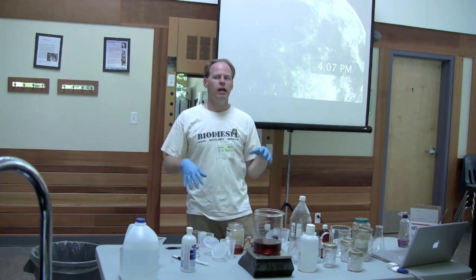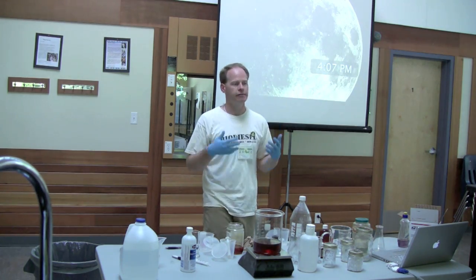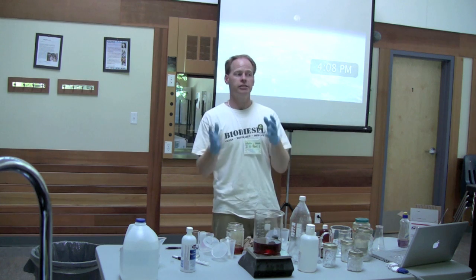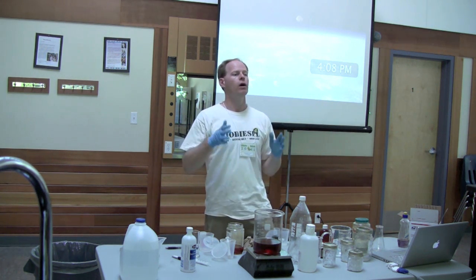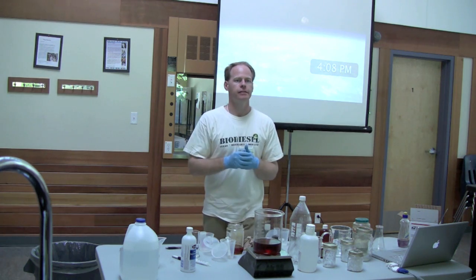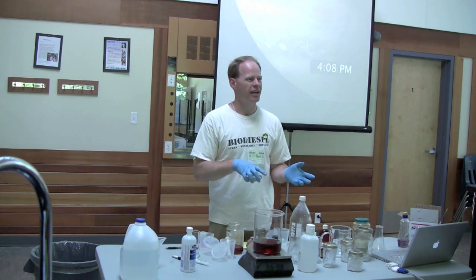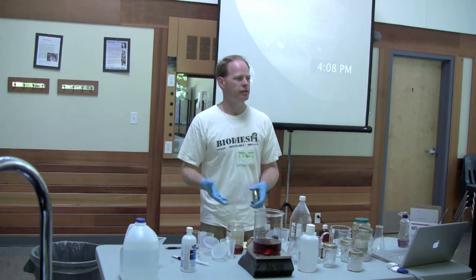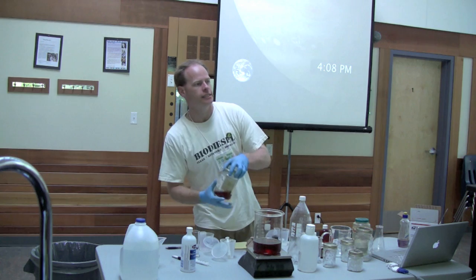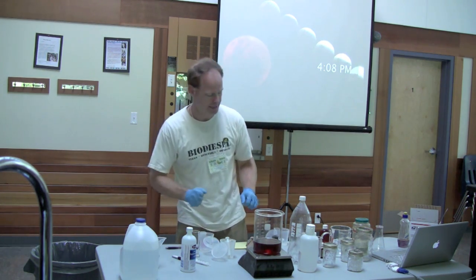Unless you absolutely know your oil is the exact same, every single batch after batch after batch, and one day the cook decided to pour soap in your oil and it threw it all off, but since you're adding the same amount, you don't know. I titrate every batch of oil I make. Always have. There's a lot of people that get away with not doing that, and then they call me when they run into the bad ones, and the first question I ask is, what was the titration? Titration is so easy to do that it really helps you understand where your oil's at.